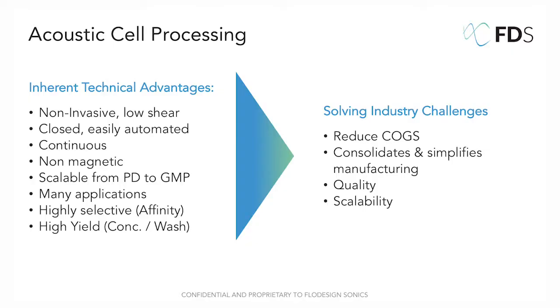So what does acoustics do for the processing of cells? Well, it's a non-invasive, very low shear technique. We've calculated that the cells are only suffering something like 200 inverse seconds of shear stress in the process. So there's no centrifugation, there's no filtration, there's no bumbling across a spinning filter or anything like that. So it's very gentle on the cells. It's a closed system. It can be easily automated. You can do continuous or batch processing.